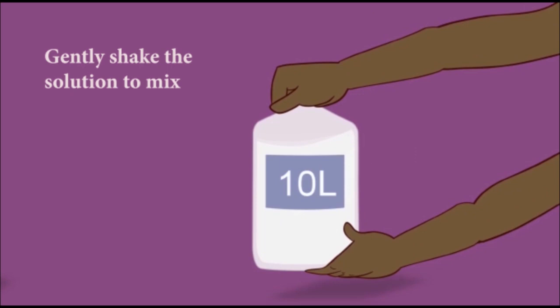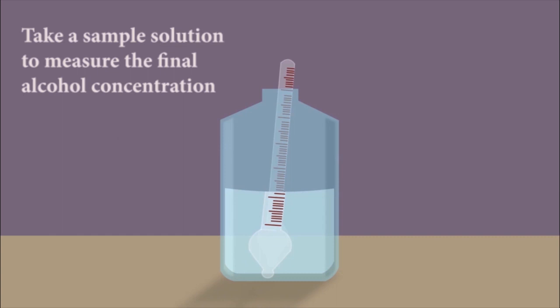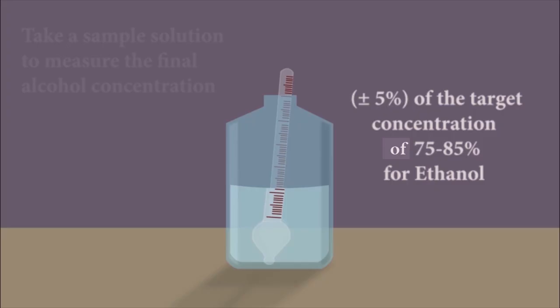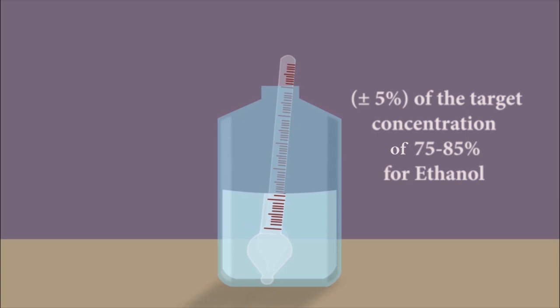In making larger containers, a paddle can be used before closing the lid. Depending on the container size, take a sample of the hand rub and using the alcohol meter measure the alcohol concentration of the final use solution. The accepted limits should be fixed to plus or minus 5% of the target concentration of 75 to 85% for ethanol.